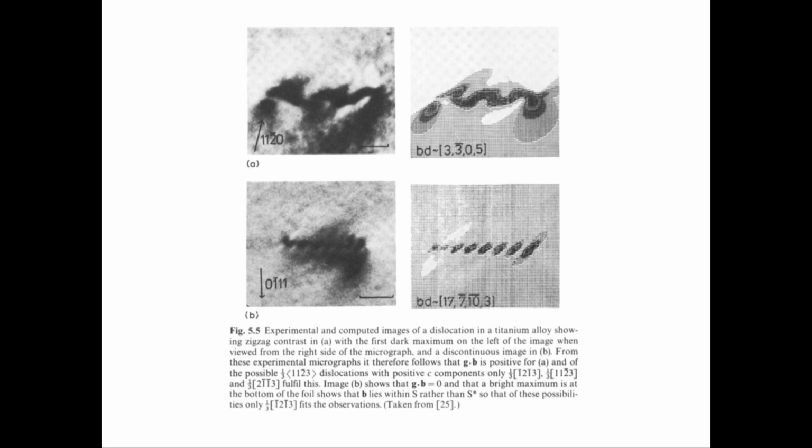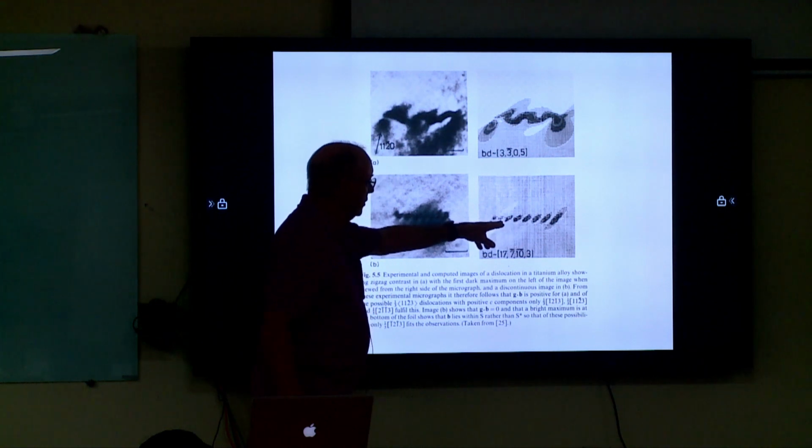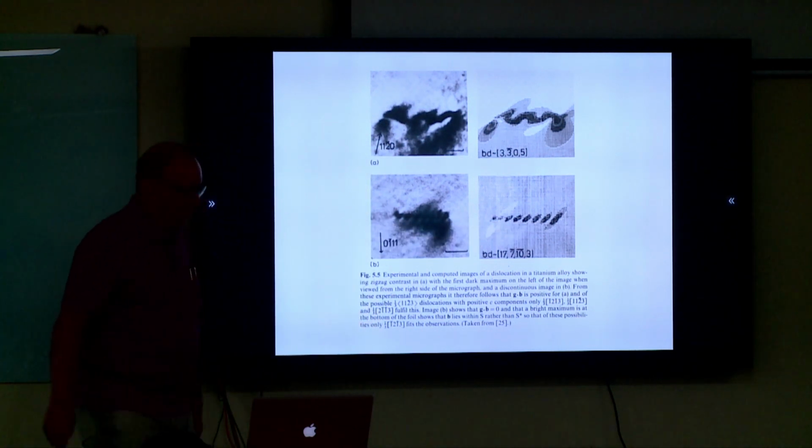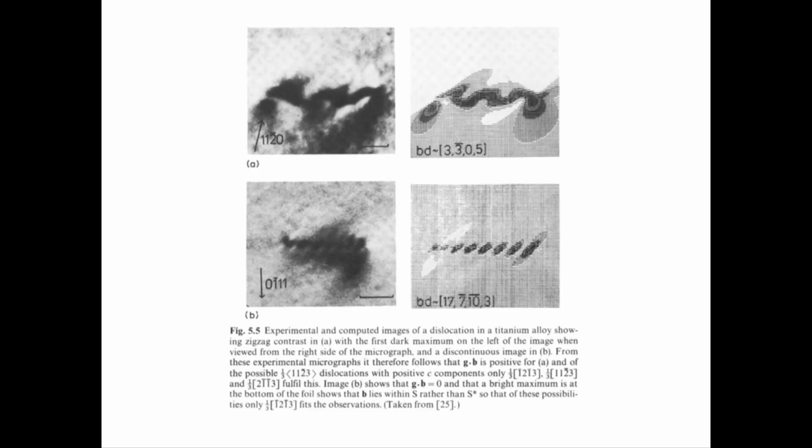And these are more up-to-date images, not very well projected here, but it's actually calculations where you can now see what we call the double dotted contrast here, which tells us that we have a G dot B 0 case where we have some residual contrast.